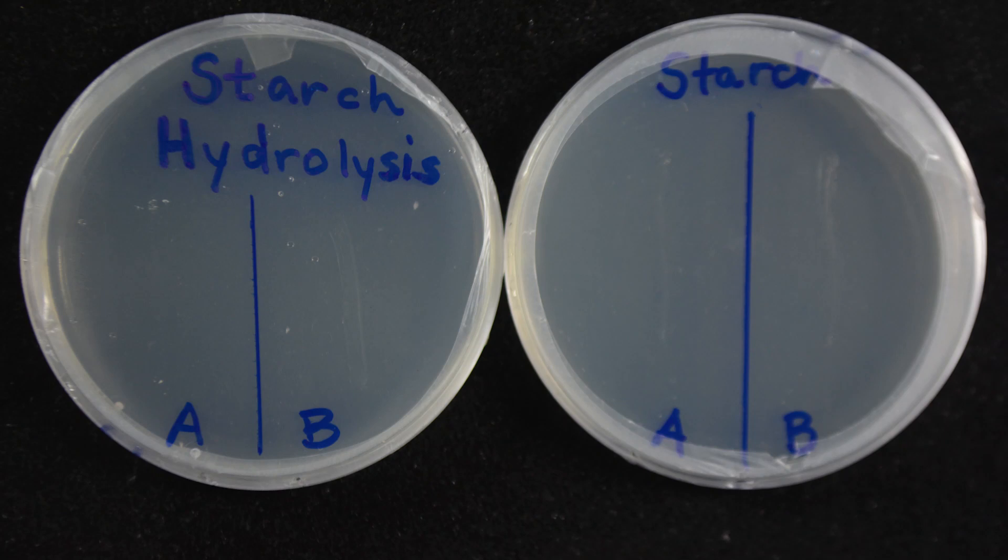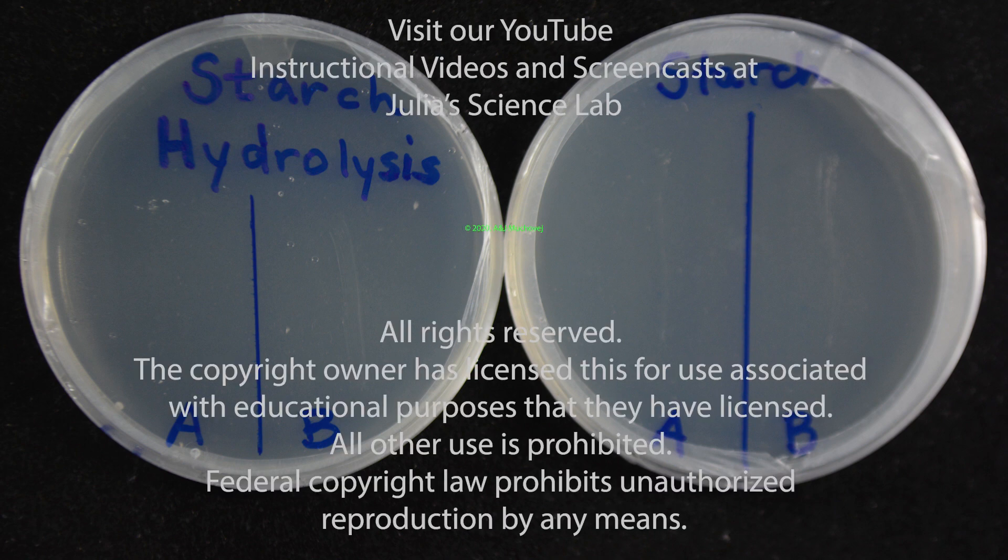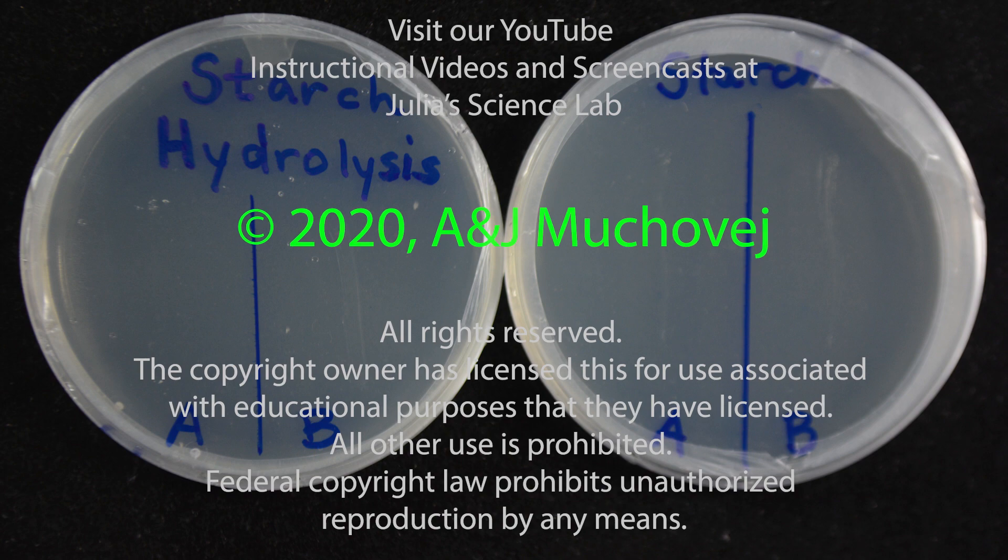Invert the plate and incubate it in an upside down position for 18 to 24 hours to see the results start to show. We will film the growth so you can follow what's going on.